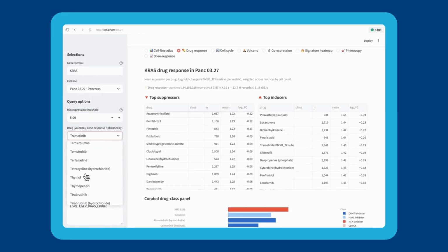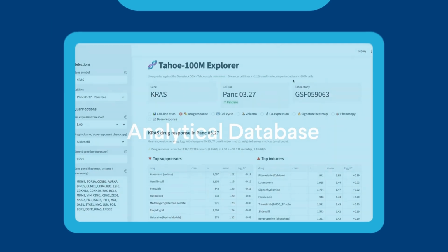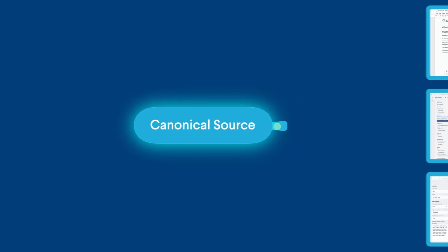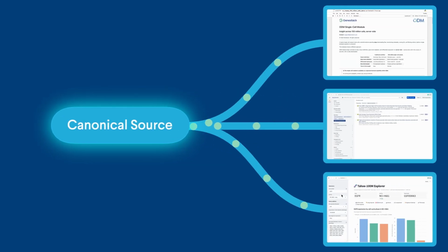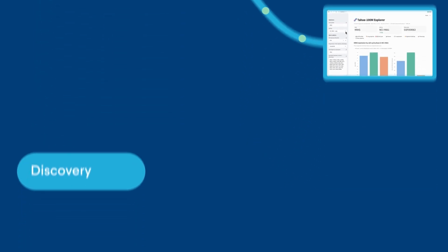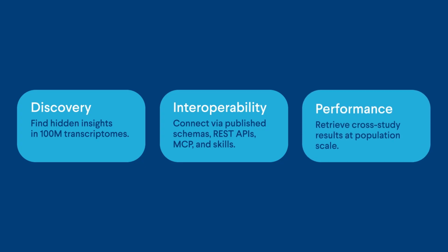The paper calls that trustworthy data, the T it adds to FAIR, and it is what makes an agent's output defensible. Rather than duplicating data, ODM acts as the connective substrate, enabling researchers and agents to retrieve only the data they need, when they need it, in the right shape, through trusted and governed operations. Genestack's Open Data Manager is a FAIR-by-design platform built for multimodal, traceable, hypothesis-driven discovery across canonical, public, and proprietary data, with cross-study performance at scale.